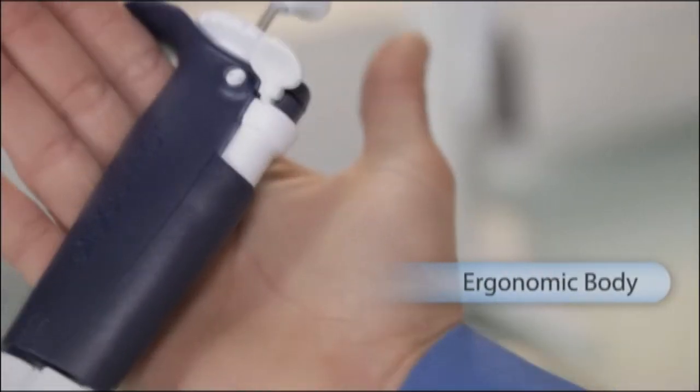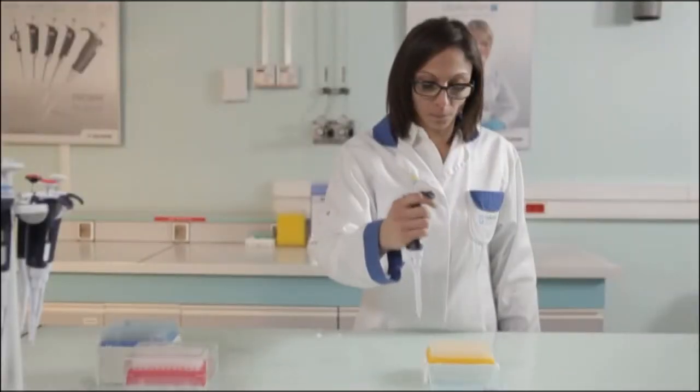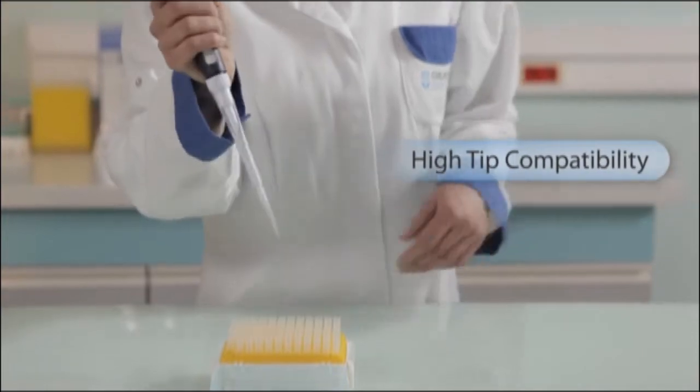The new Pipet-Man L body shape is made to suit all hand sizes. A very easy fitting of the tip will ensure a perfect seal on the Pipet-Man L.